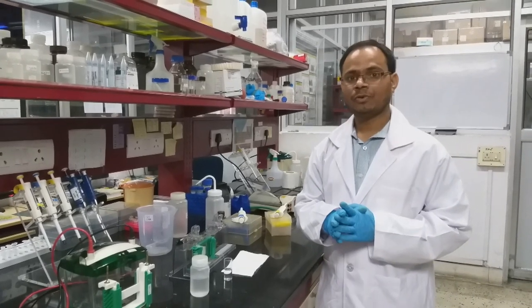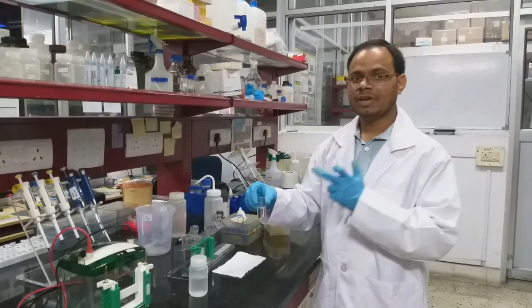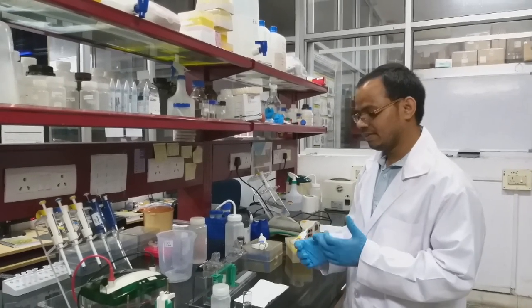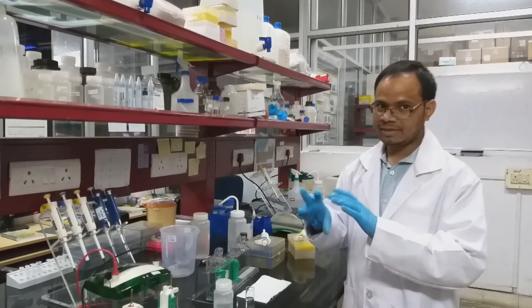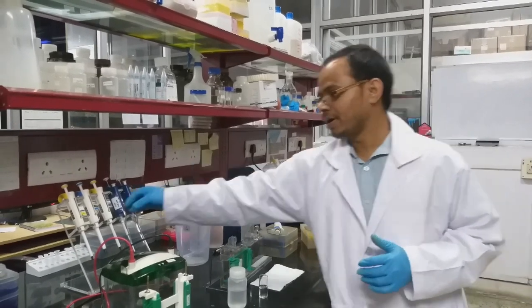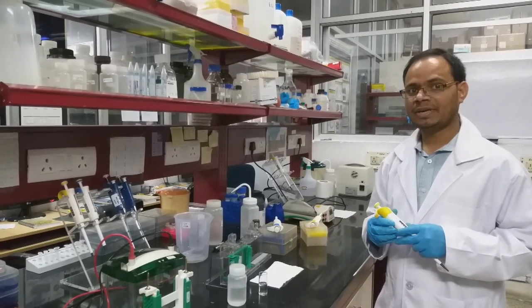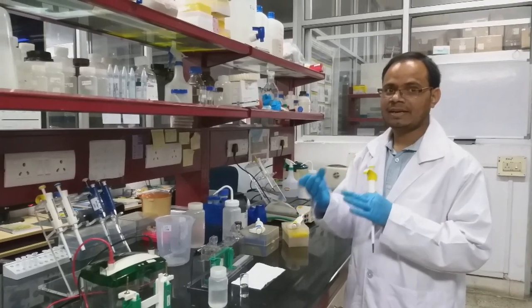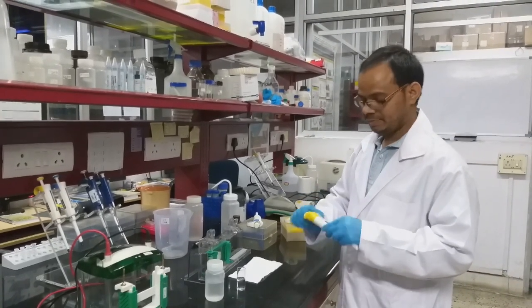In the final step, we have to add TEMED. After adding all the components, at the end we have to add TEMED. Because if you add it earlier, it will quickly facilitate polymerization, so you cannot take it out with the pipette, it completely solidifies. That's why you have to add it at the end. So I'm going to add 5 microliter of TEMED, which catalyzes the ammonium persulfate. Ammonium persulfate in turn provides free radical species, and free radical species accelerate the polymerization. This is the overall principle of this resolving gel. So I will add TEMED.